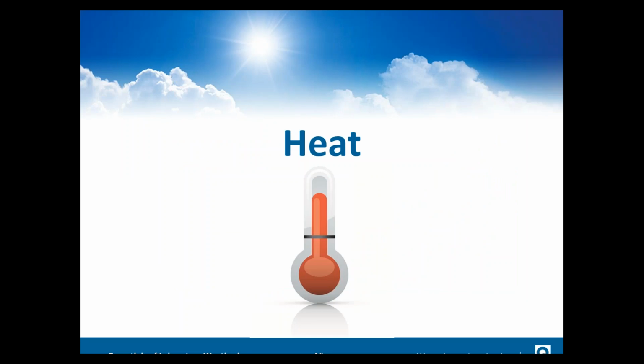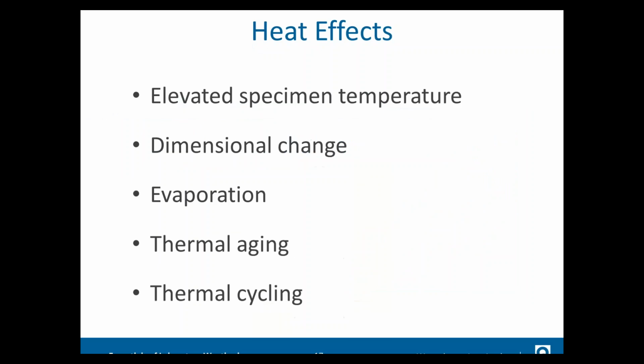The next factor of weathering that we're going to talk about is heat. Now, apart from the fact that any kind of elevated temperature increases the amount of reactions in solution, there are a number of effects that heat can have, particularly when we talk about thermal cycling. A lot of these materials are coatings on substrates, and if the substrate and the coating have different expansion and contraction properties, heating and cooling, fast heating and cooling in particular, can cause stresses between those materials. So dimensional change and thermal cycling are very important to simulate in weathering.